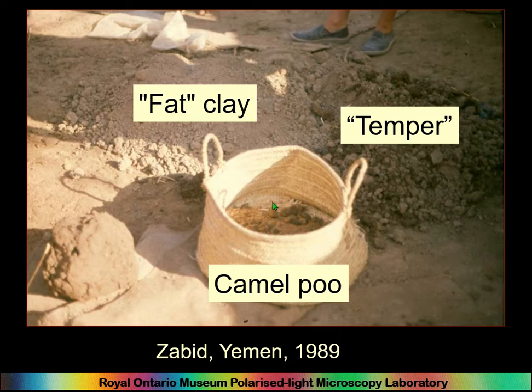this sort of additive is actually very good for making pottery. It adds to the plasticity of the pottery, and is a useful temper.